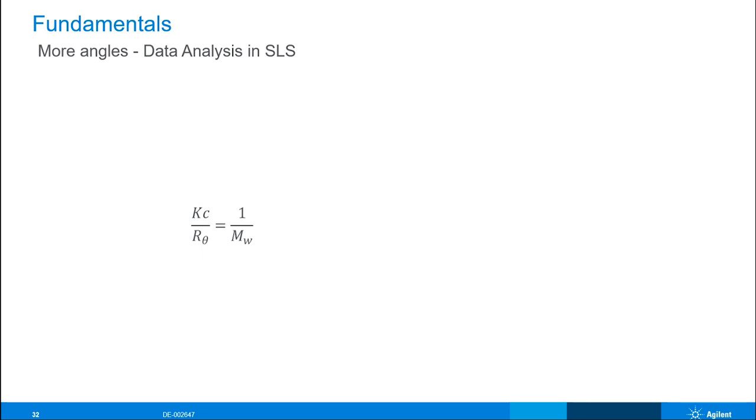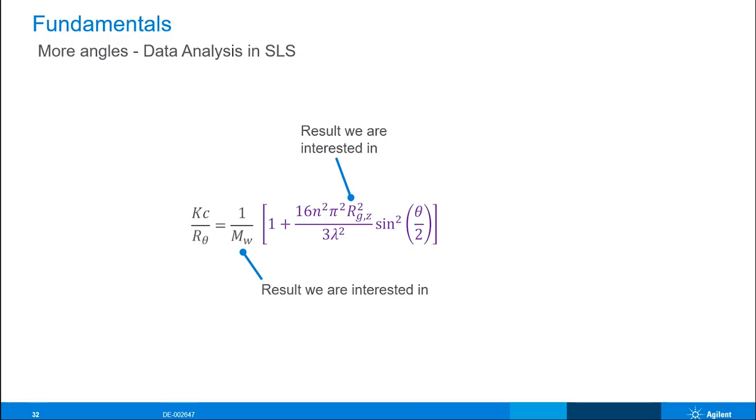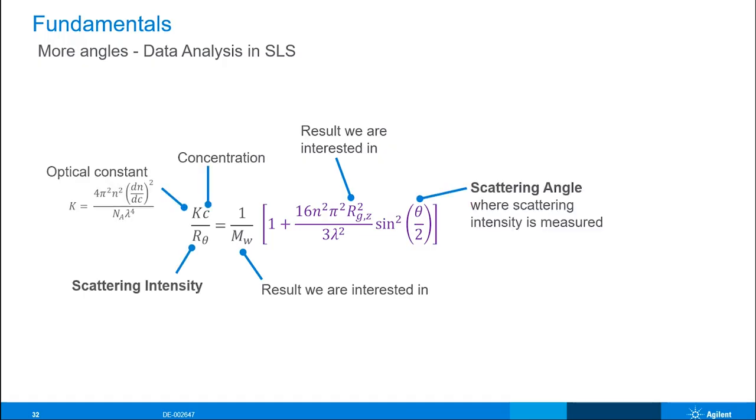Again, just reminding you of some of what these other constants are as well, but the main point here being, if you're looking to get size in solution information from static light scattering, you need to have angular dependence within your material. Otherwise, you'd have to consider going to some other characterization technique to get an Rg below, say, 10 nanometers, like small angle X-ray scattering.